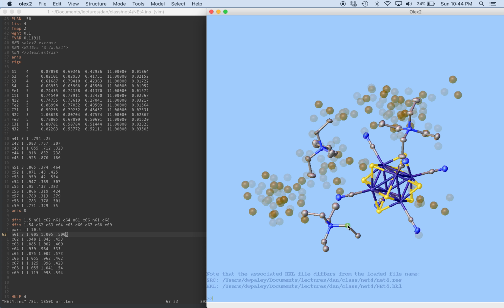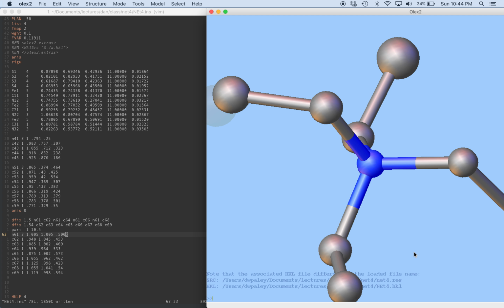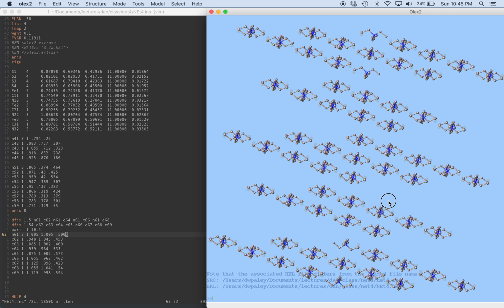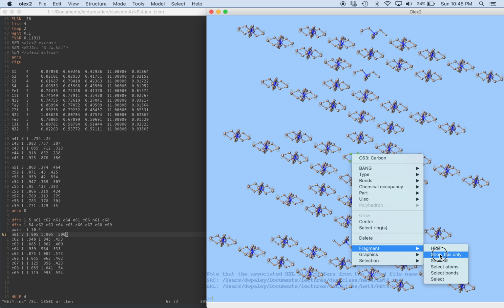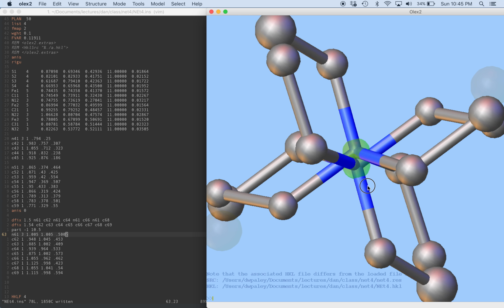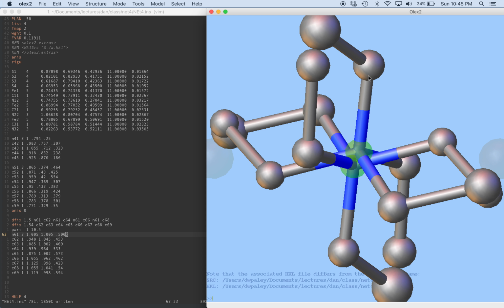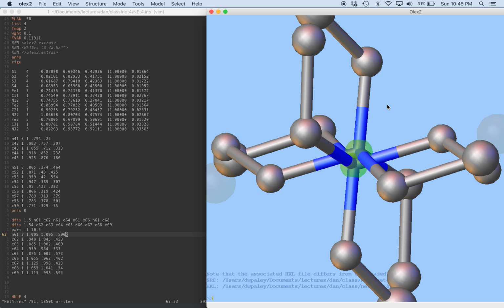And we can ask ourselves, how far off the symmetry element did that nitrogen move? I'm going to type pack and show, wow, this looks kind of cool. I'm going to show just one of these. The nitrogen actually moved pretty significantly off the symmetry element. It moved by about 0.1 angstrom. And it moved in the direction, I would assume, of that one carbon that was a little farther, had a little bit longer carbon-nitrogen distance than we expected before.